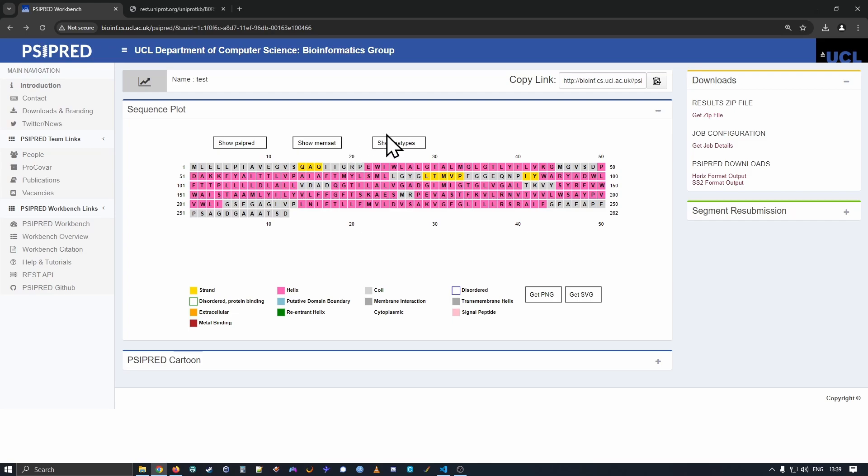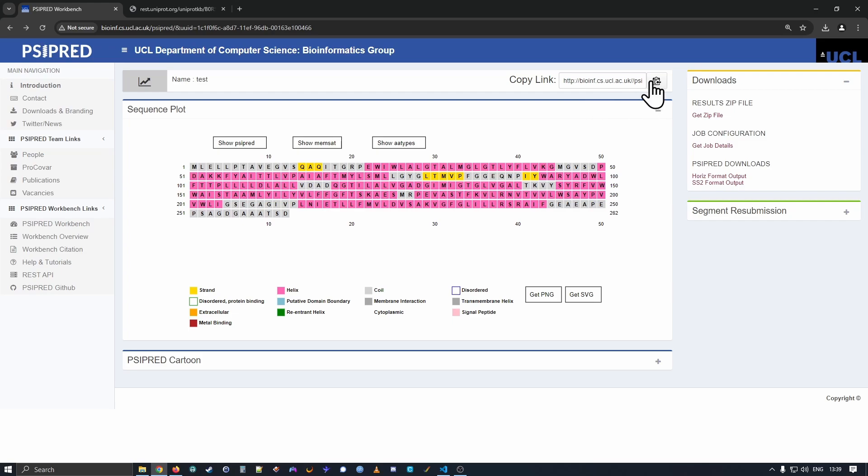So let's walk through the results page. At the top here, we give you the name of the sequence that you submitted. So this is the name that you provided to us. That's just repeated here so you can keep track of what you're looking at. If it was a long running analysis and you wanted to close your web browser, you can use our copy link region here to copy the link and use that link to retrieve the results in the future.